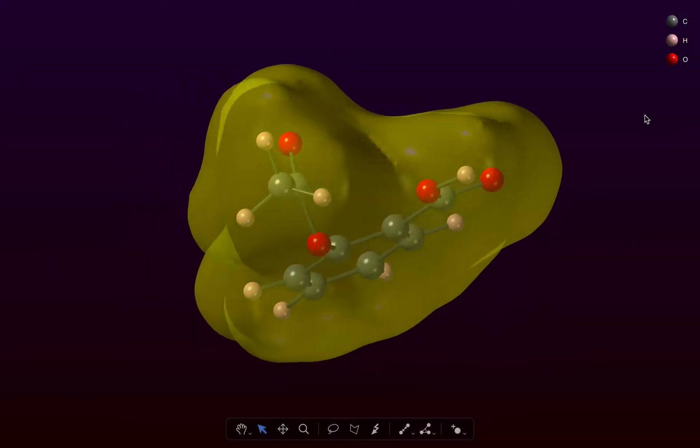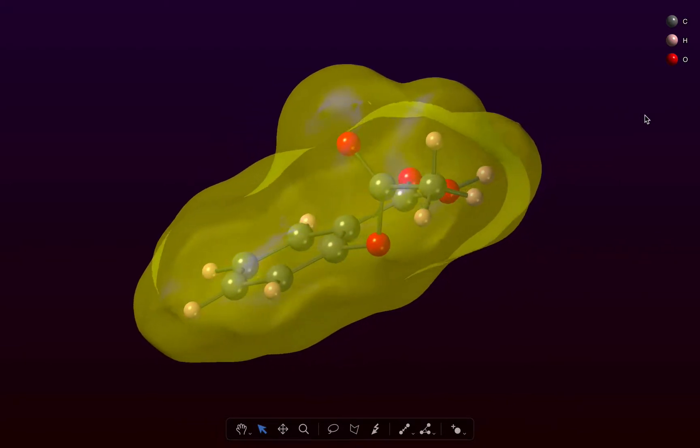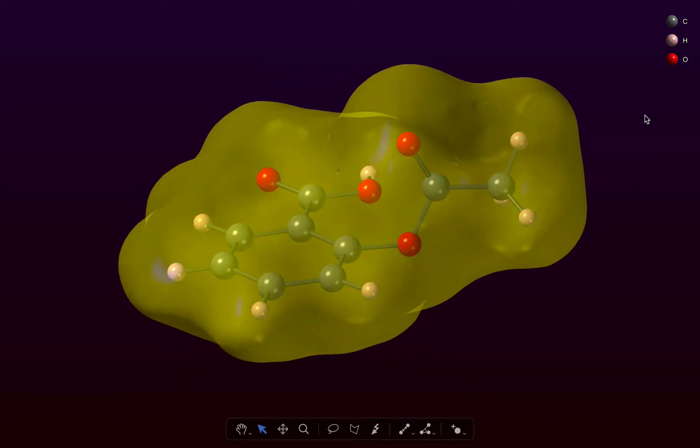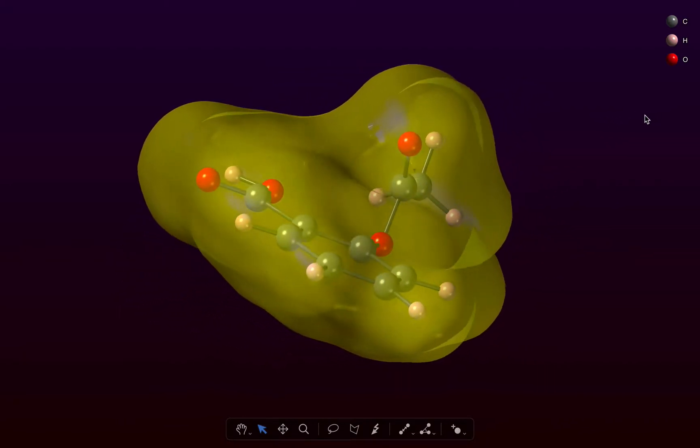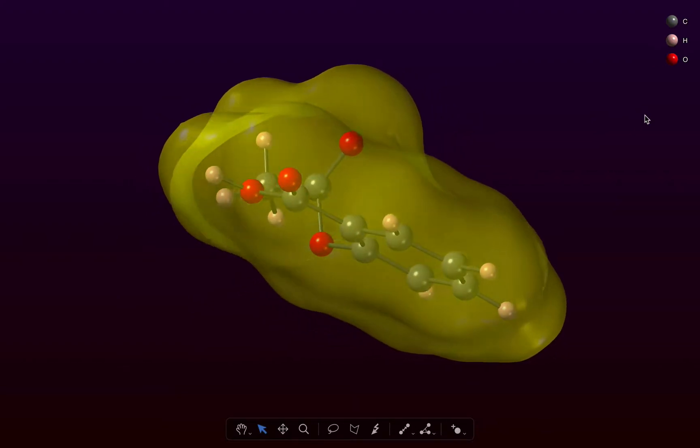Welcome to CrystalMaker 10. In this tutorial we're going to look at ways in which you can load a molecular crystal, visualize it in different ways, and make measurements.